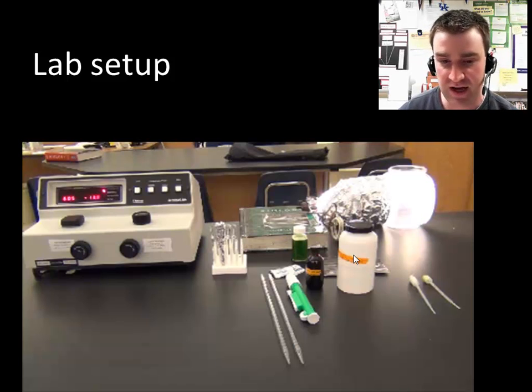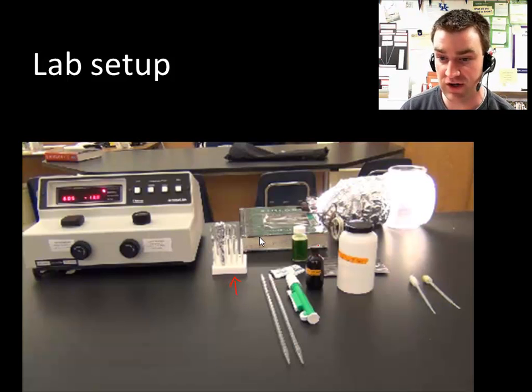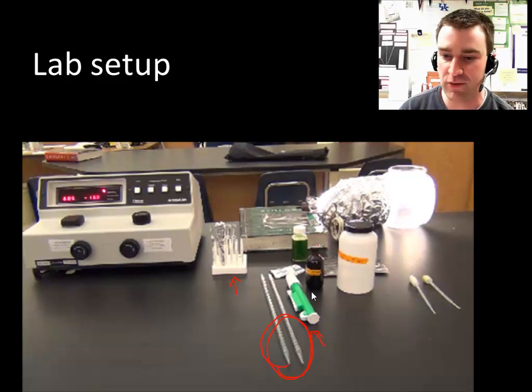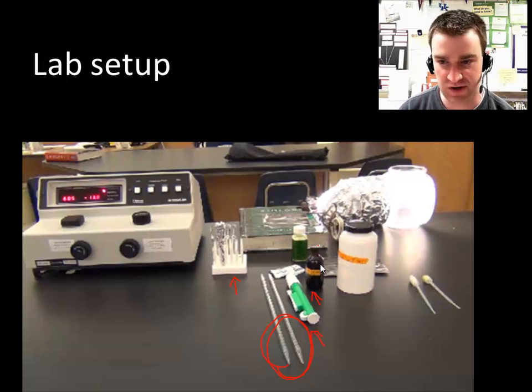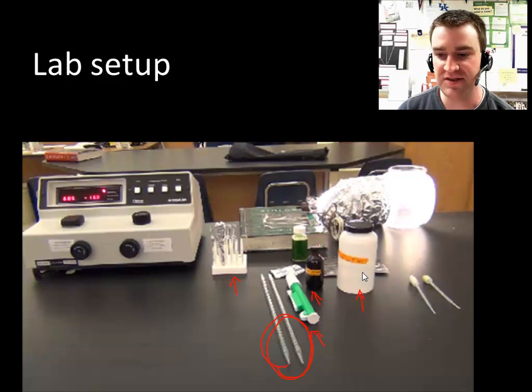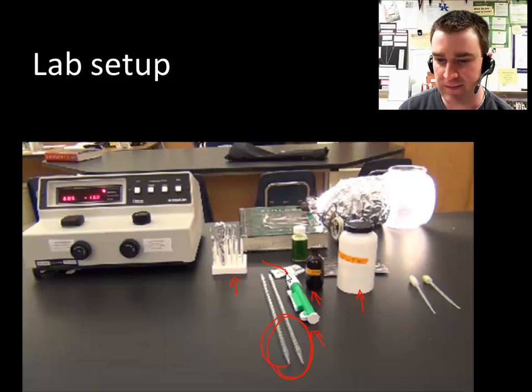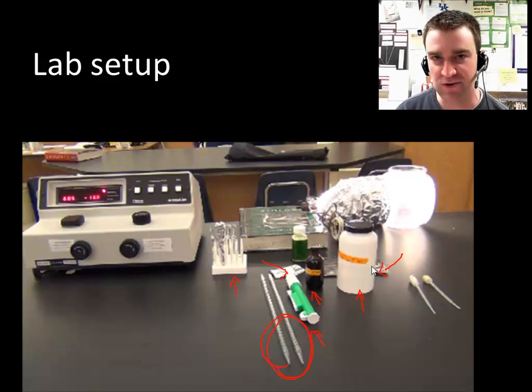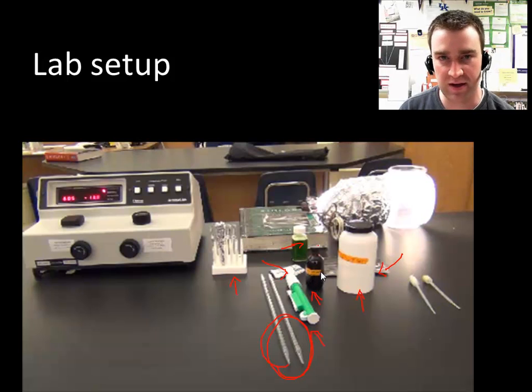This is what your laboratory setup might look like. You've got the spectrophotometer, all the cuvettes in a cuvette rack, and aluminum foil for your dark cuvette. You've got large pipettes to fill five milliliters of solution, and a device to draw the liquid up through those pipettes. You'll have access to a mixture of phosphate buffer, DPIP, and water to add to most cuvettes. I'll keep the jar of phosphate buffer and water to add to your blank cuvettes myself. You've got parafilm to mix everything, and tissue paper to wipe down the cuvettes before putting them in the spectrophotometer. You've also got a source of spinach chloroplasts prepared as described.